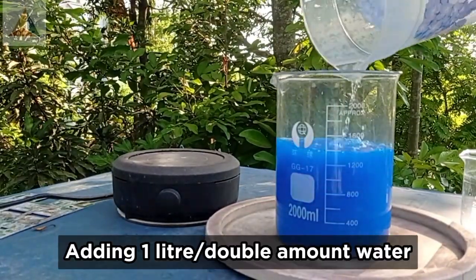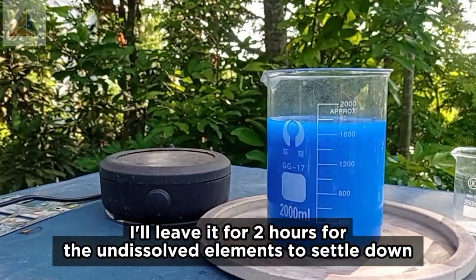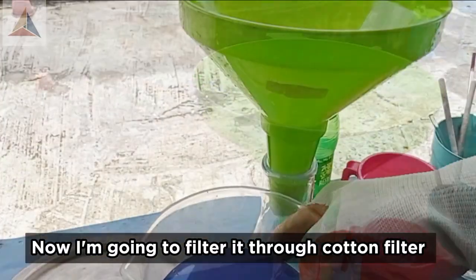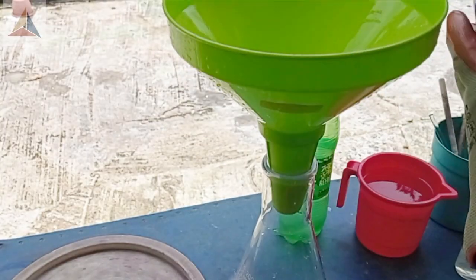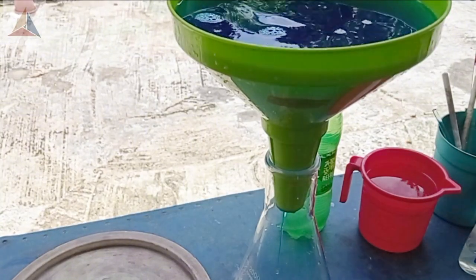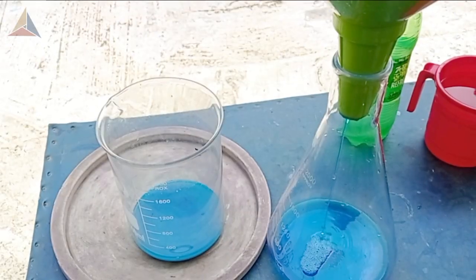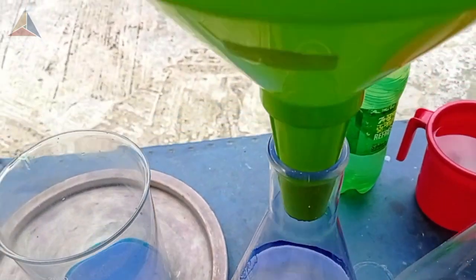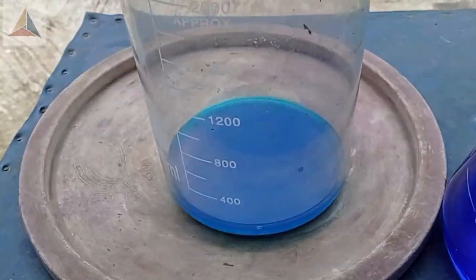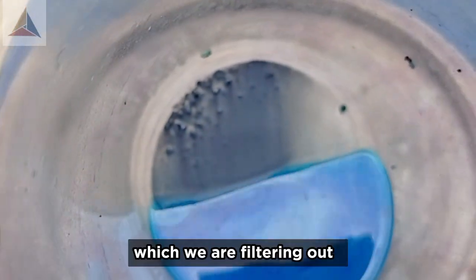Adding 1 liter, or double the amount, of water. Water will decrease the density of the acid. I'll leave it for 2 hours for the undissolved elements to settle down. Now I'm going to filter it through a cotton filter.